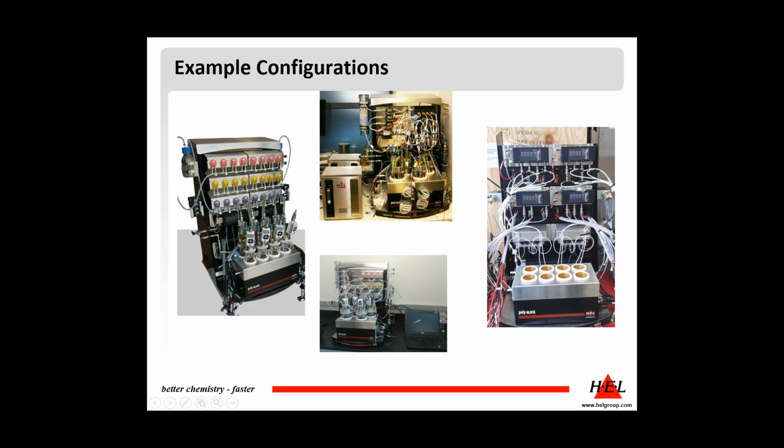In this particular example, we have 8 bioreactors, and they needed quite a lot of feeds, liquid feeds going into each reactor, mass flow controllers here. Then we have a 4-zone system at the top. It's hard to see, but these are stainless steel reactors going to 6 bar pressure, 500 ml volume.